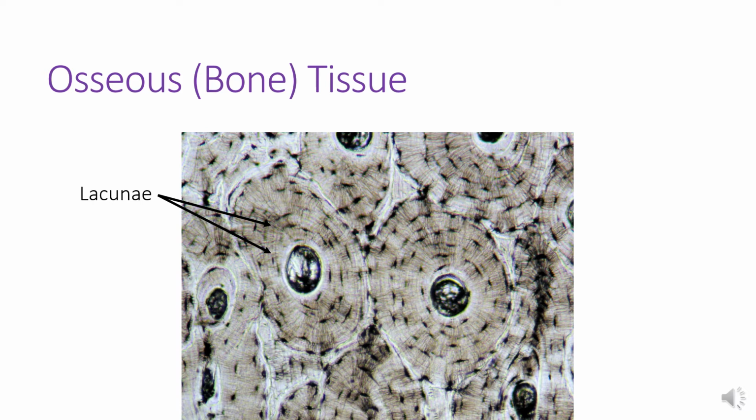Something that's a little bit different here, though, is that most of the time when osseous tissue is removed and turned onto a microscope slide, the living cells are typically not captured, and we're left with these hollowed out, dark-looking chambers where the cells would have been found in the living tissue. There's still the lacuna, which is an artifact of how the bone grew.